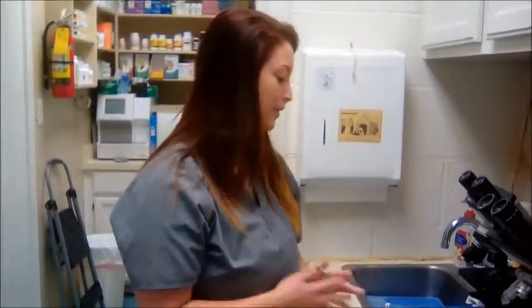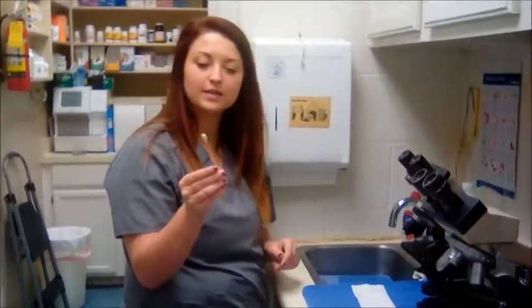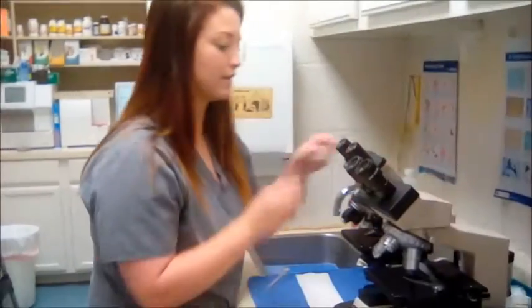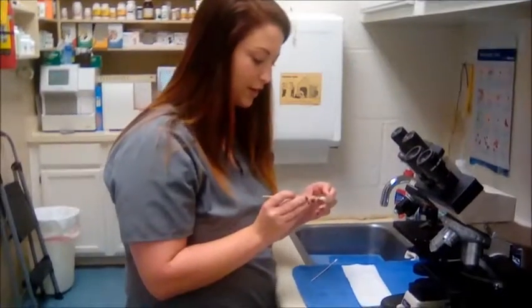Hey, my name is Ashley Mays and today I'm going to be doing an ear yeast exam. I've recently collected this sample and I'm going to start by taking a slide and I'm going to just gently roll the sample onto the slide.